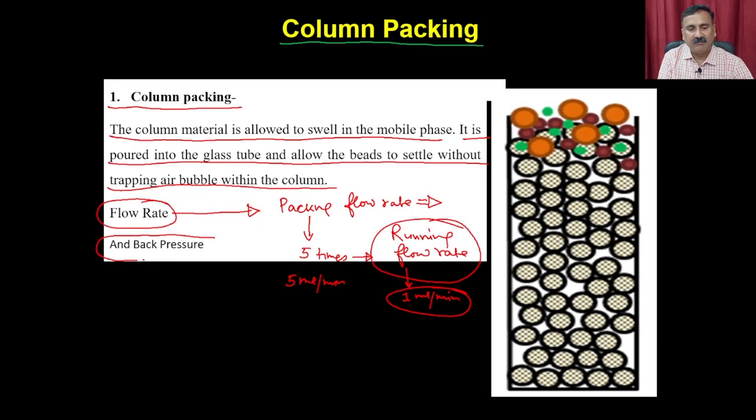And then you also have to see the back pressure. So back pressure also should be compatible with the protein purification system that you are using. We have prepared a small demo clip so that you can understand how to pack a column and how to run the gel filtration chromatography.